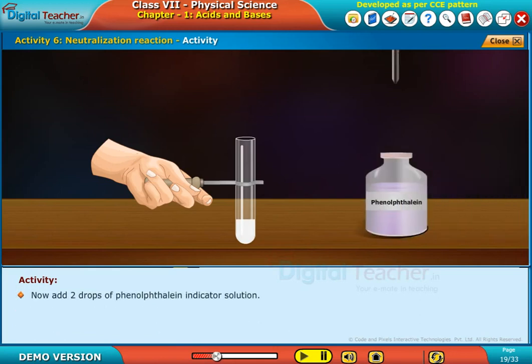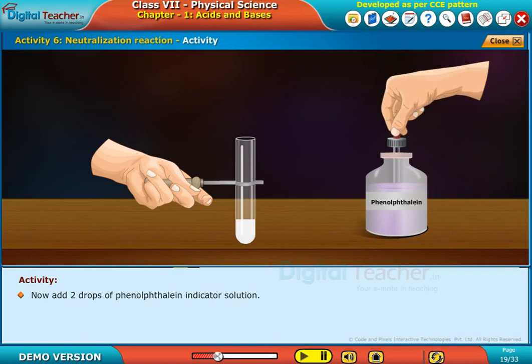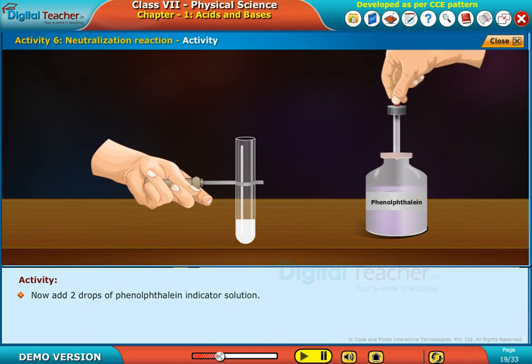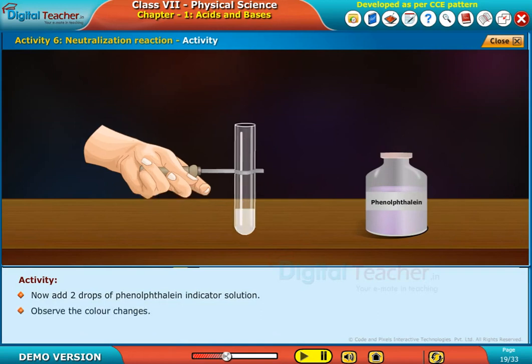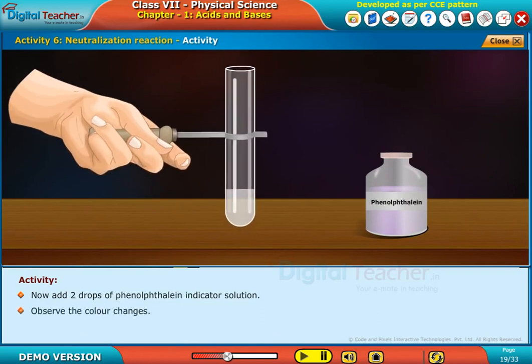Now, add 2 drops of phenolphthalein indicator solution. Observe the color changes.